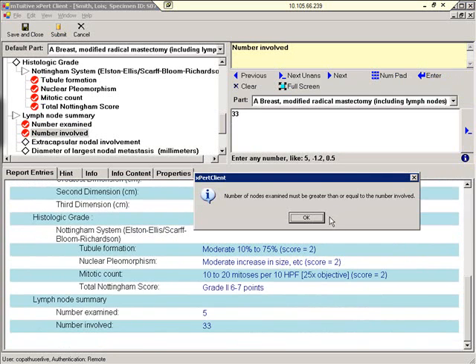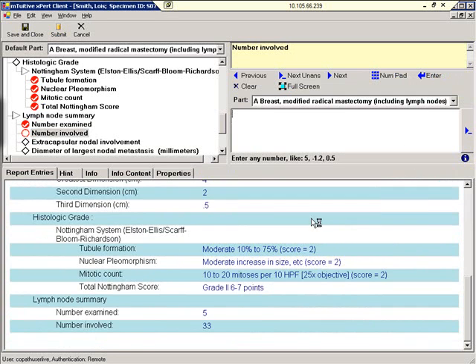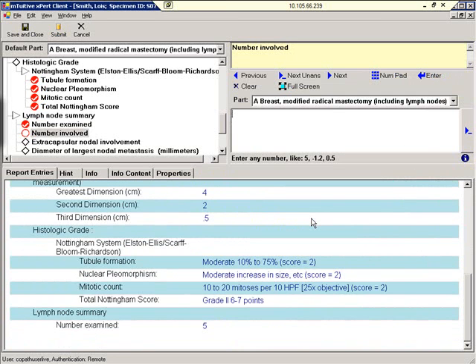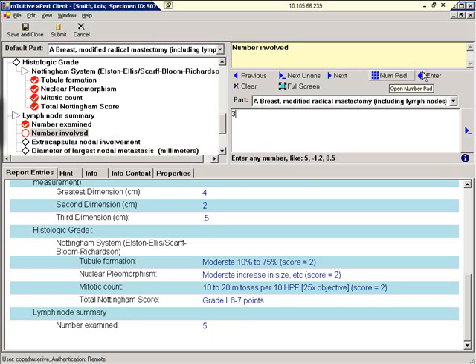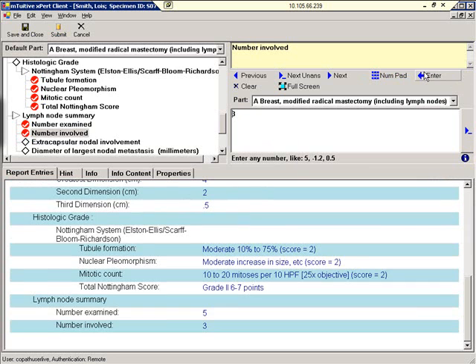We get an alert message, advising us that the number involved must be lower or equal to the number examined. We'll click OK to acknowledge that message. This is another example of how Expert prevents unintended errors. We'll enter 3 and click Enter.